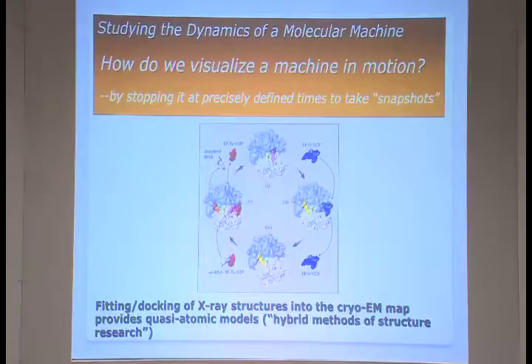And what happens to the macromolecules like the ribosome, which has 50 proteins, 3 big RNAs, and then several factors and tRNAs? Each one has some motion, but they really work in a concerted way. They need to orchestrate very nicely to perform the function.